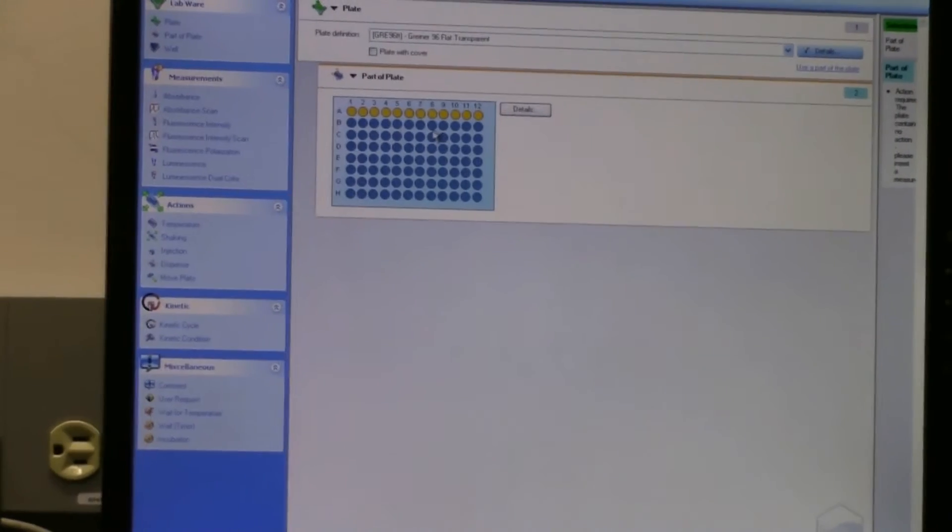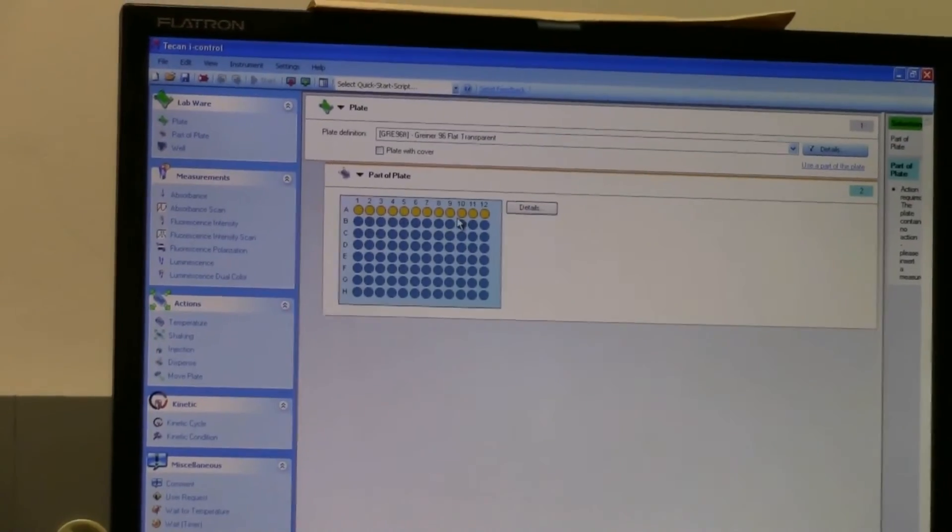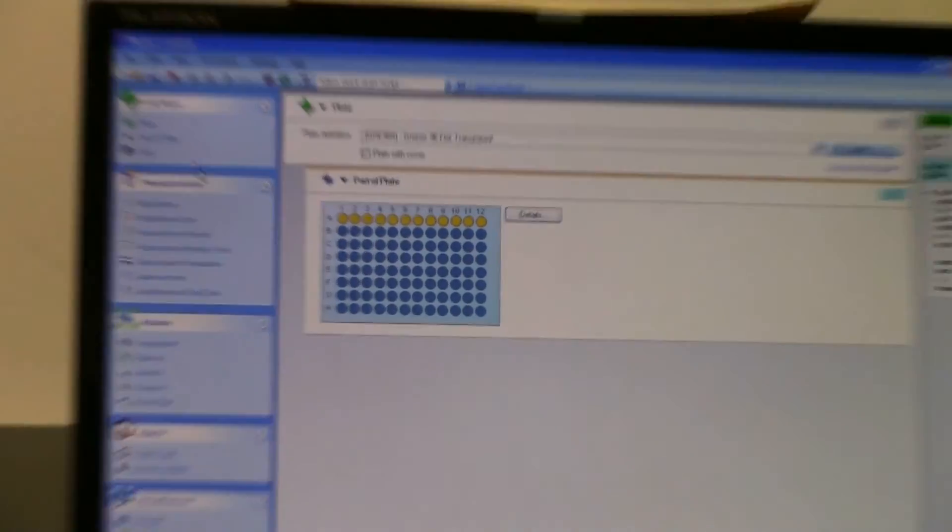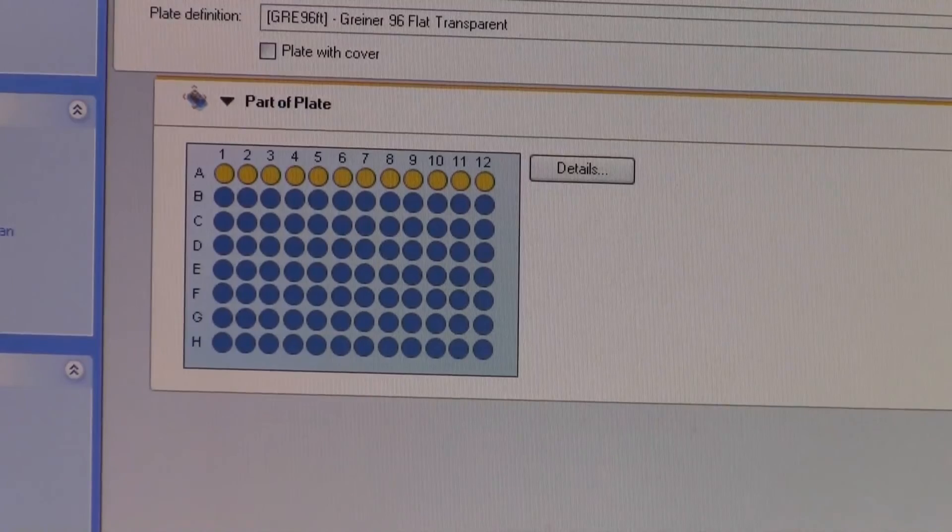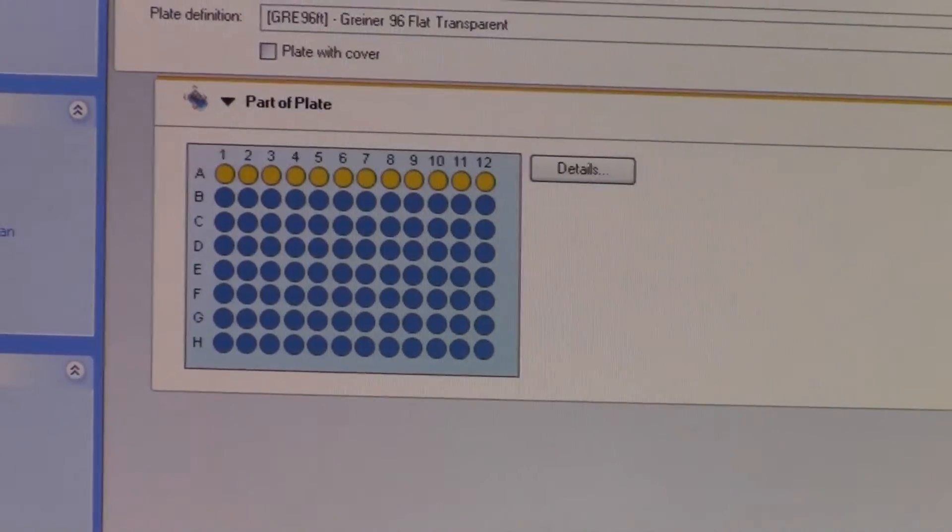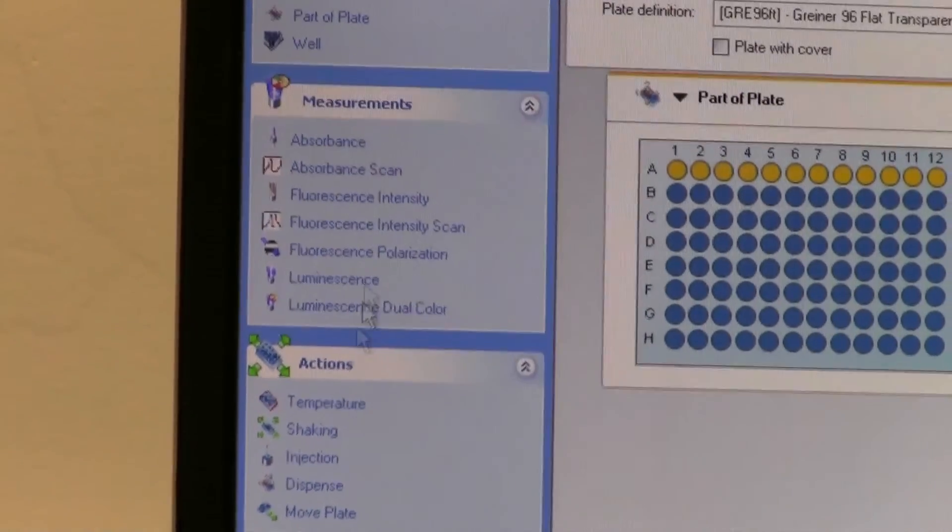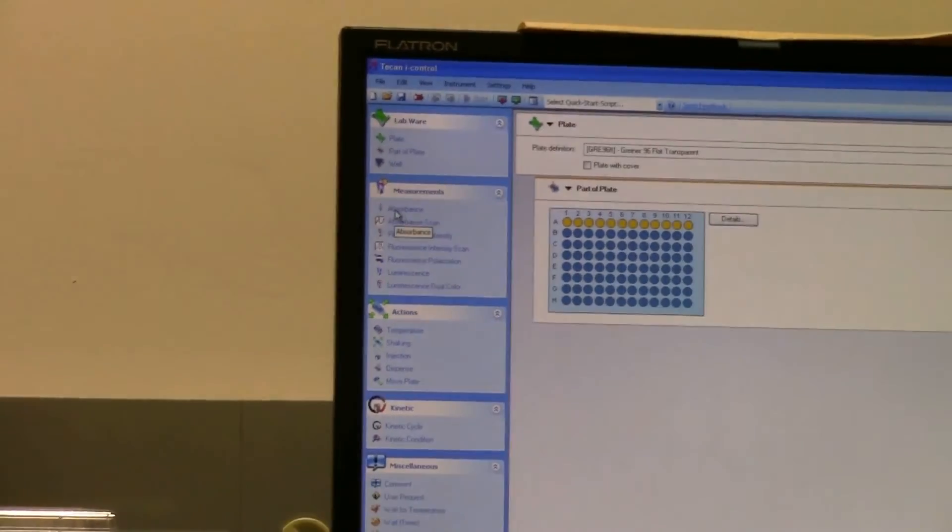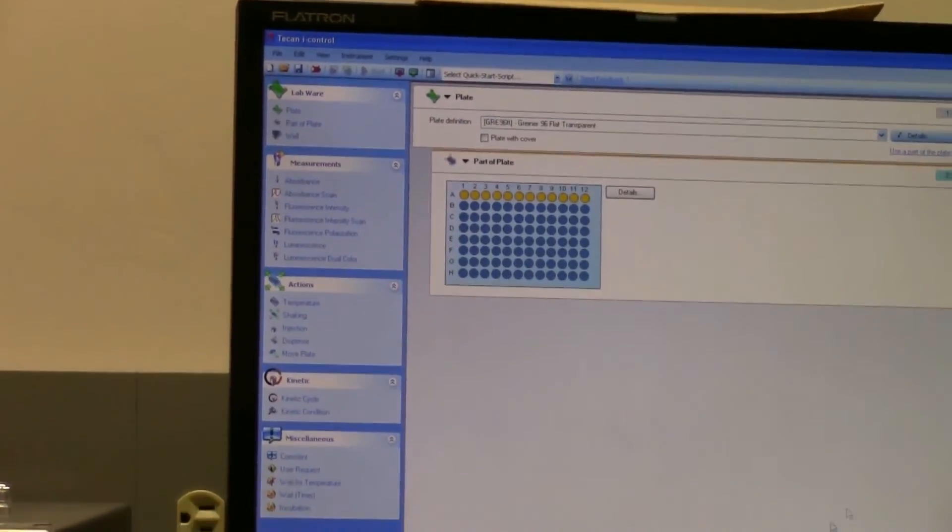In terms of measurements, everything is basically here on this side, on the left here in actions. And you just - whatever you need to do, you basically just click and drag into this area here.